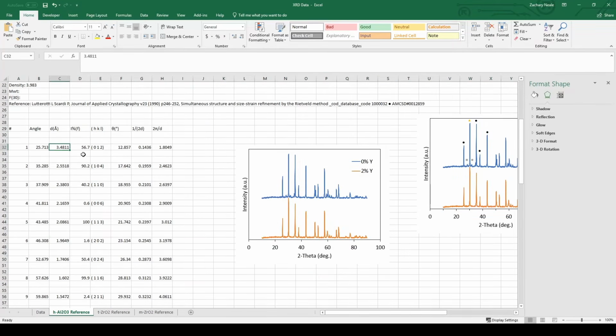All right, now before and after each of these angles, you want to put the same angle, and then for the intensity you will put 0. So that way, when you plot this, it will have a flat line at 0 intensity, and then once it gets to that angle, it will make a peak at that angle to that intensity value. So for example, the first angle, we can start with your data, which would be 10 degrees, and then this one will be the value before and also the value after, right? And you repeat that for all of them.